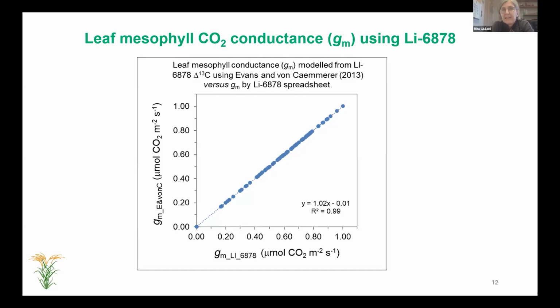It's just an empirical validation of the calculations by the new tracer, because the model we use in the lab is essentially the same one, based on Evans and von Caemmerer. Maybe in the new tracer there are some adjustments implemented later, but it's the same model. So we say, yes, the calculations are fitting what we expect.